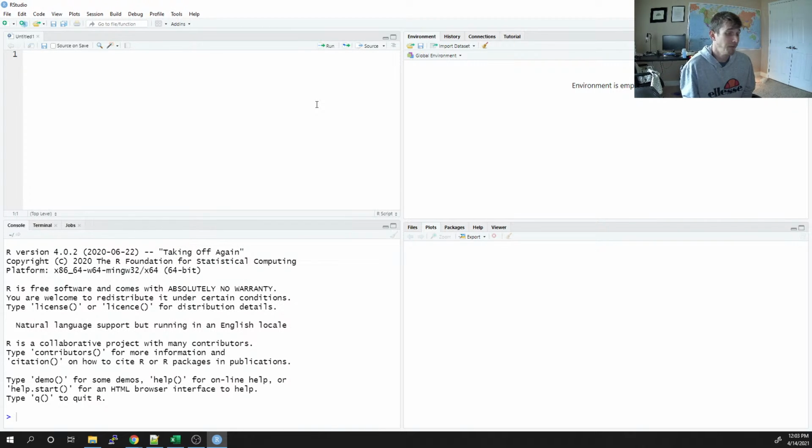I think that's by far my most popular video. So it suggests that DESeq isn't exactly a friendly package, but it's not all that bad to use either. Although tutorials help, nonetheless. So this video is basically going to be the same as that one.